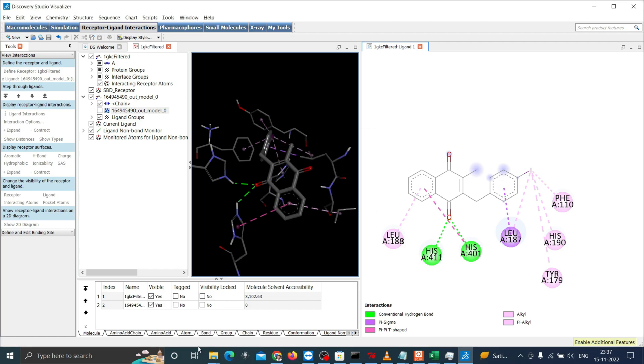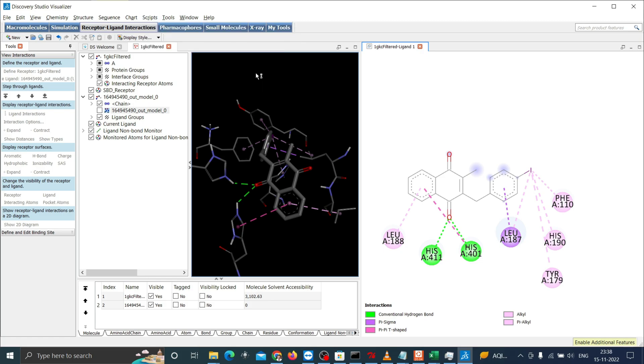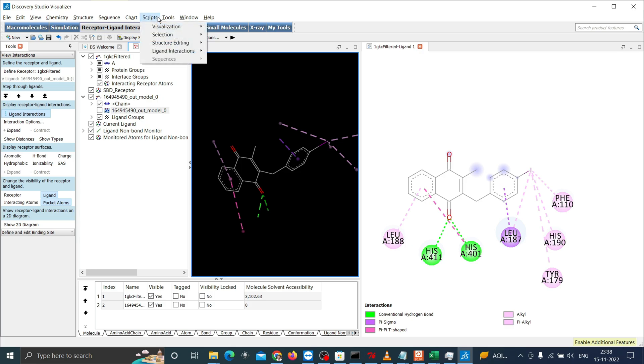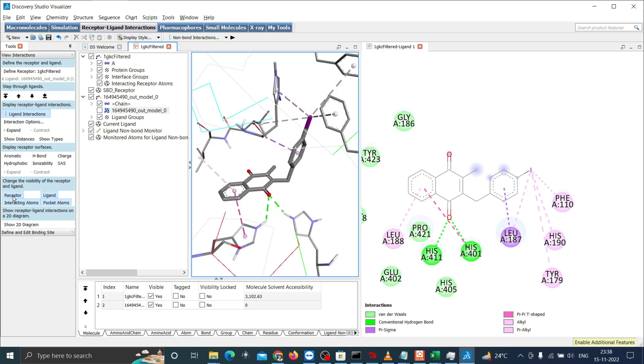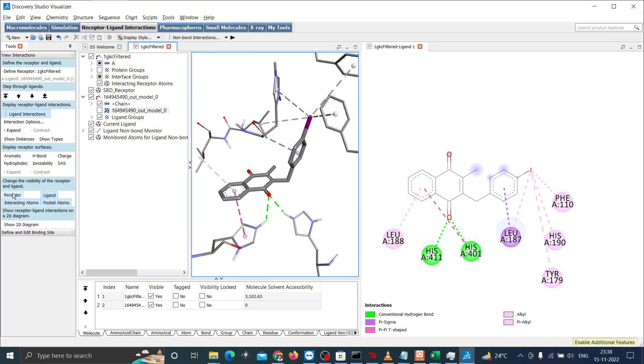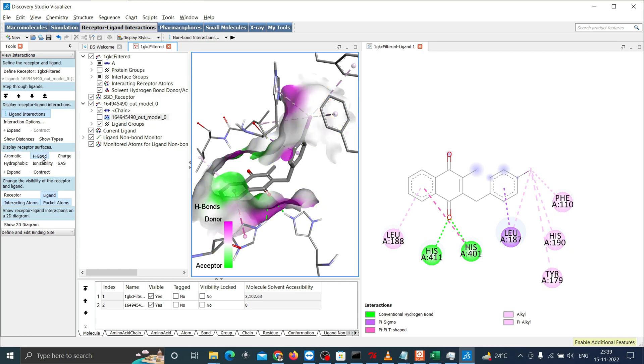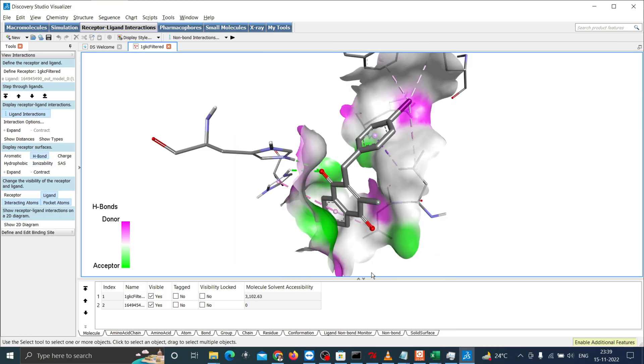Similarly you can view the ligand protein in 3D following this. If needed you can optimize graphical interface and go to the scripts visualization and the publication quality. Then visualization of protein can be done by clicking on the receptor or selectively visualize the surface like aromatic or hydrogen bonds. Now you can save this also as an image for your paperwork.